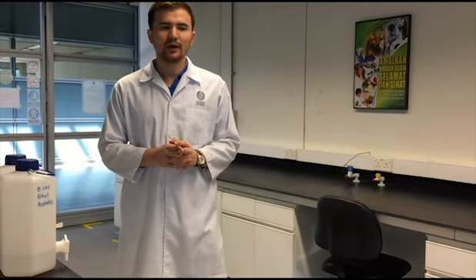Good afternoon. So today I'll be explaining the errors and recommendations part. In this experiment, the first error that might appear is that the reading of the volume of ethyl acetate required to prepare the 0.1 molarity ethyl acetate solution is not accurate due to parallax error. To prevent that error, we can ensure that eye level is parallel with the meniscus of the ethyl acetate when reading the level of the ethyl acetate required to be mixed with the distilled water.